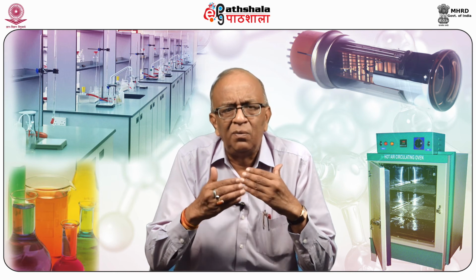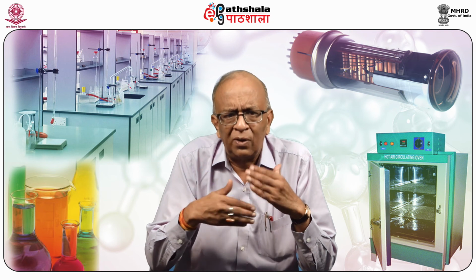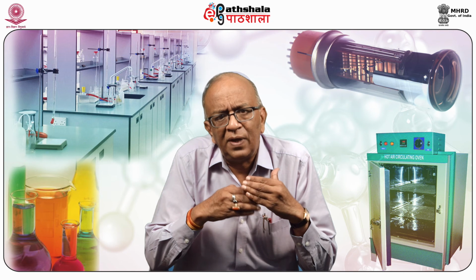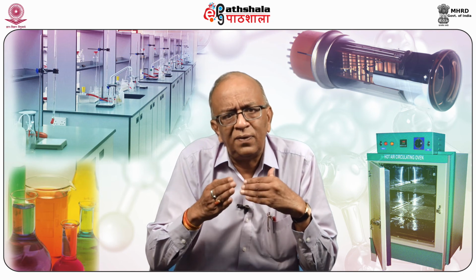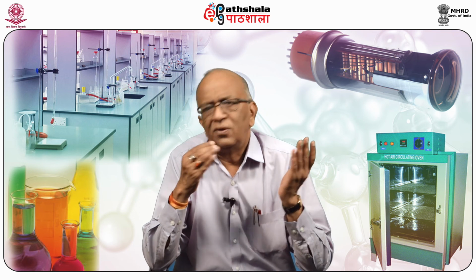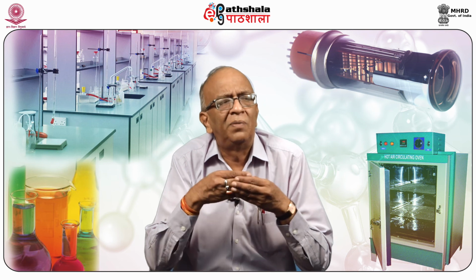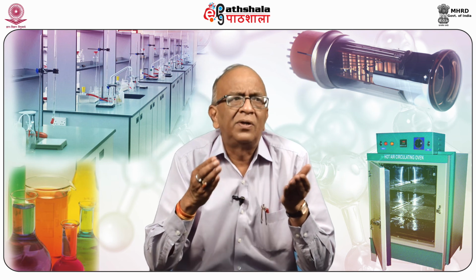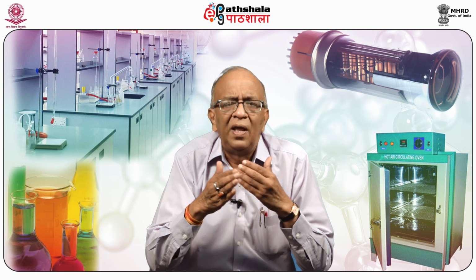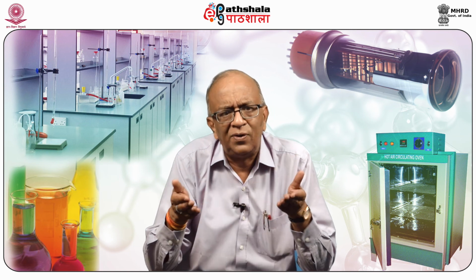Boiling and melting both are characteristic of a particular substance, and this is a qualitative parameter. Chemical changes such as decomposition or reaction may also take place at very different temperatures. Some are characterized, some will be estimated, some will be determined, quantitatively or qualitatively, by observing the effect of temperature.